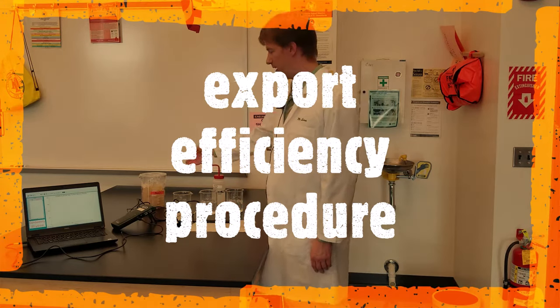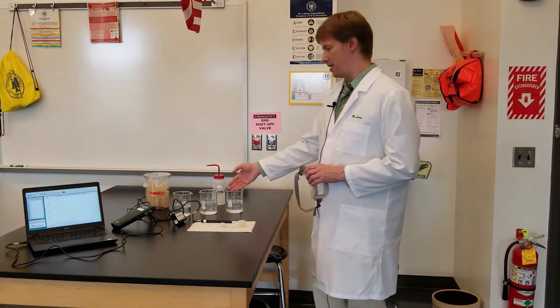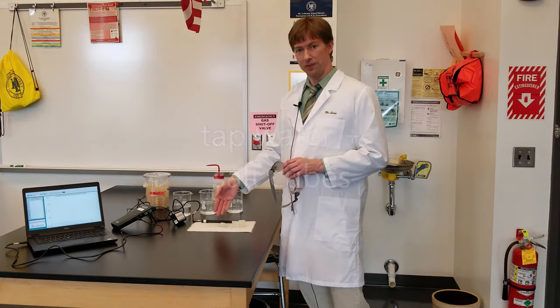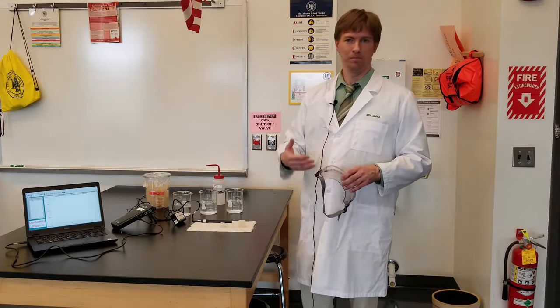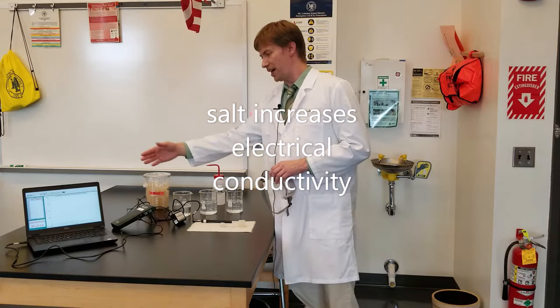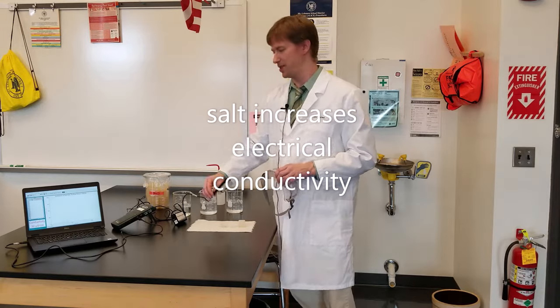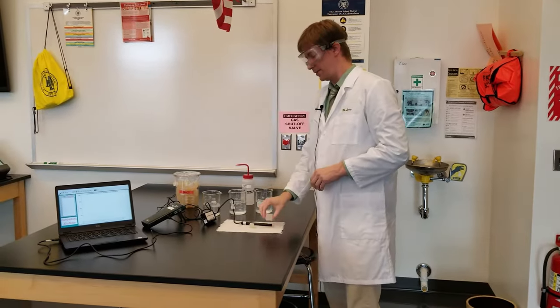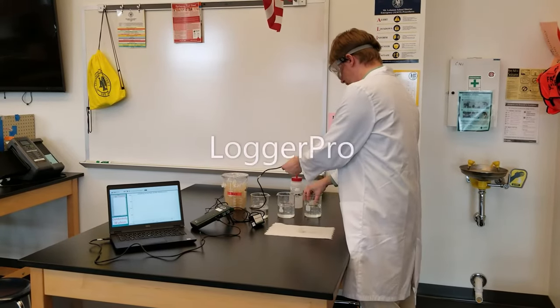These cubes are made of salt — good old NaCl. I'm going to grab my goggles again because I'm dealing with chemicals. I've got three beakers with equal amounts of regular tap water, and these cubes are made of salt. When I put the salt cube into the water, the water becomes salt water. Salt water has higher electrical conductivity, so I've set up equipment here to measure the conductivity of the water. I'll start with the big cube, drop it in the water, and immediately press go on the Logger Pro.